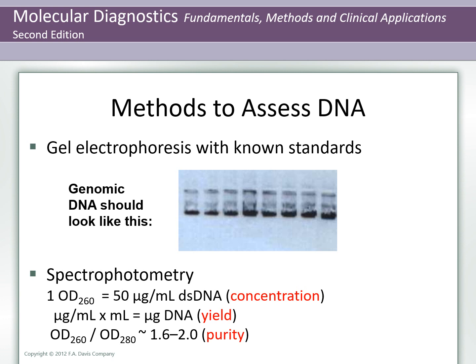To calculate the purity of the DNA sample, measure absorbance from 230 nanometers to 320 nanometers to detect other possible contaminants. The most common purity calculation is the ratio of the absorbance at 260 nanometers divided by the reading at 280 nanometers. Good quality DNA will have an absorbance ratio of 1.6 to 2.0. A reading of less than 1.6 does not render the DNA unsuitable for any application, but lower ratios indicate more contaminants are present in the sample.